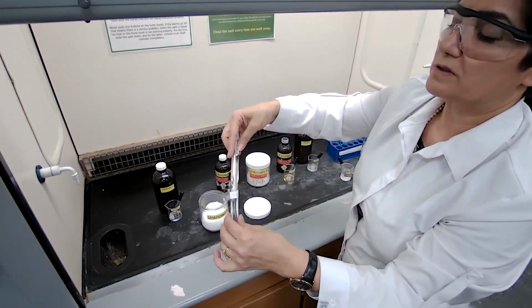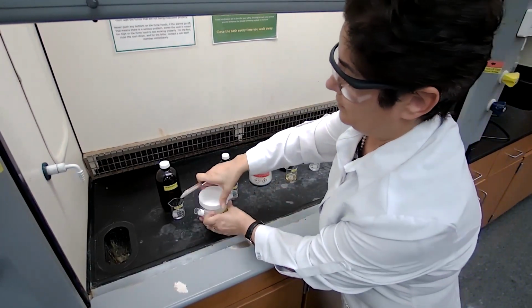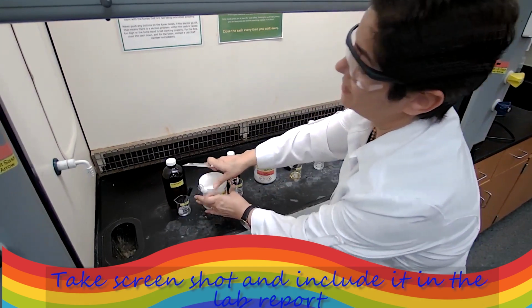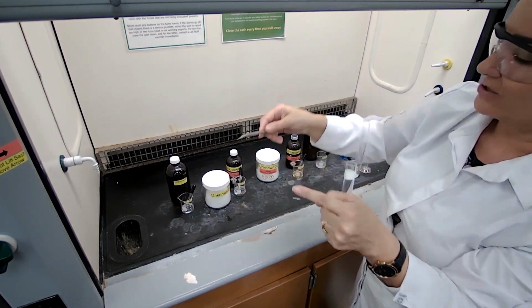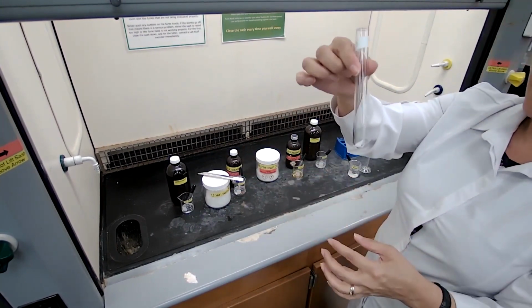Just a few crystals of the sample for this unknown. Again, tip of a spatula means about less than half, about 1/3 of the spatula. So don't put a full spatula of the sample.